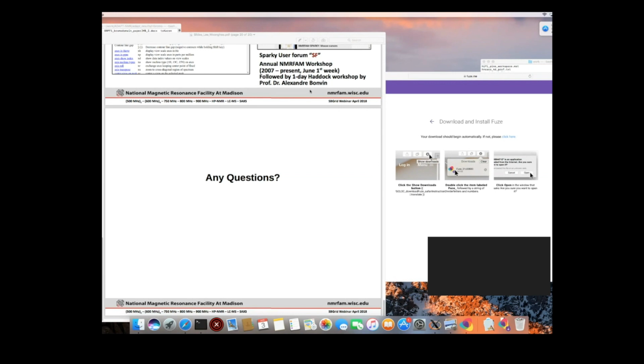Yeah, so it's the standard iterative approach to assignment. One other question that I had is the integration with TALOS-N and CS-Rosetta. It's hard to understate how much work that could save someone from a purely configurational perspective of getting all those tools to run. Those are open to all academic groups, and about how long does it take for one of those jobs to run? You said 3 hours to a couple of days. Are there limits on protein size and job length?